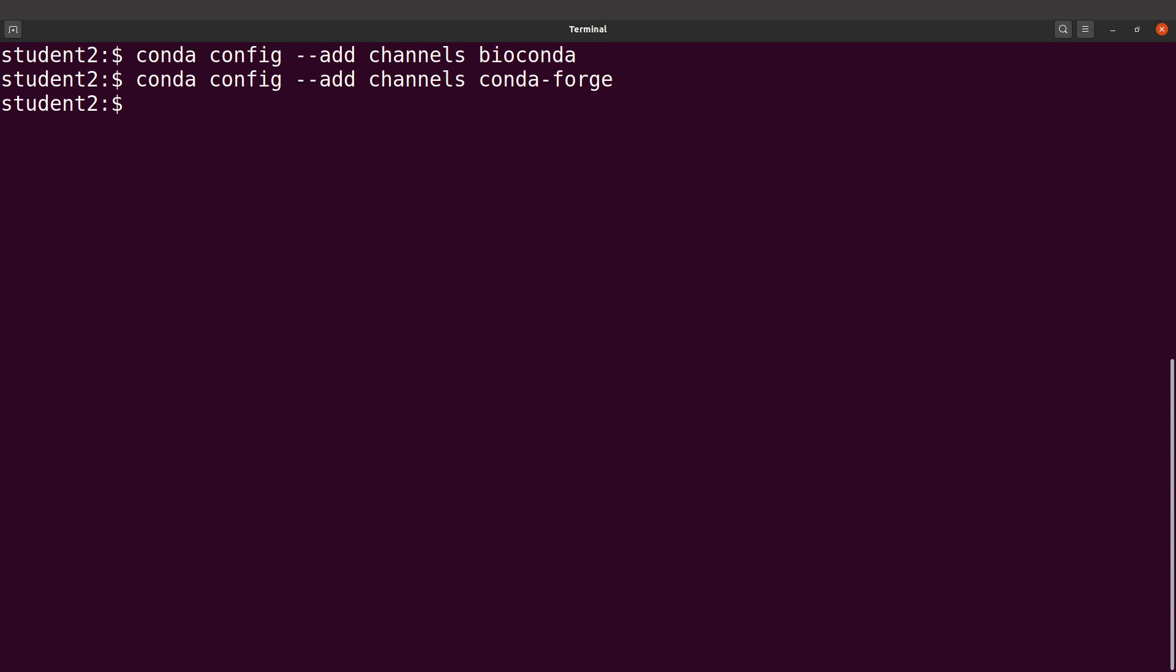Perfect, so now we're done with that. What you need to do is to install samtools. Just to keep it simple, we type conda create -n and then we specify the name of the environment that we want. Let's say samtools - this is the environment's name - and then we specify the software itself, which is also samtools.